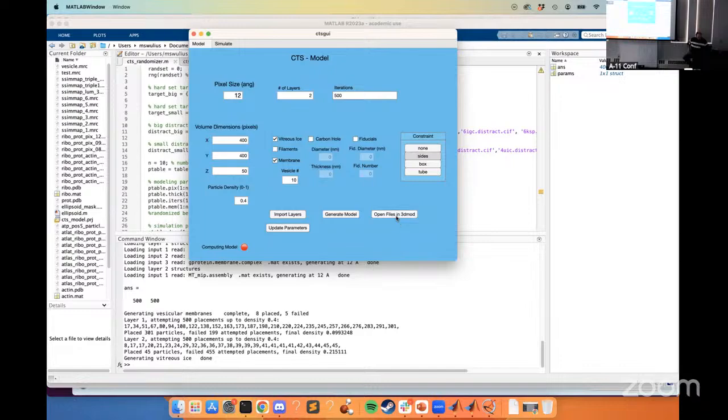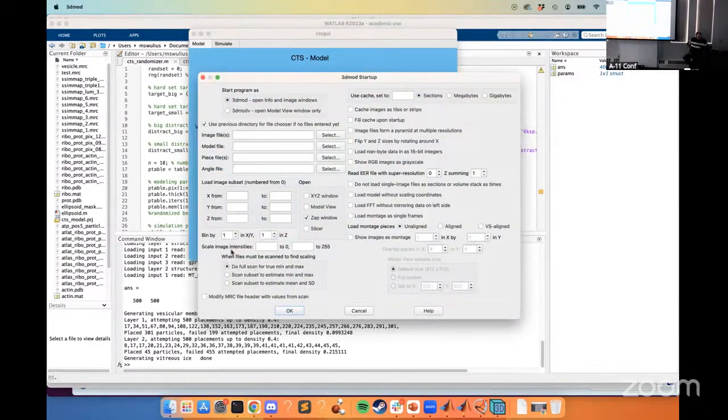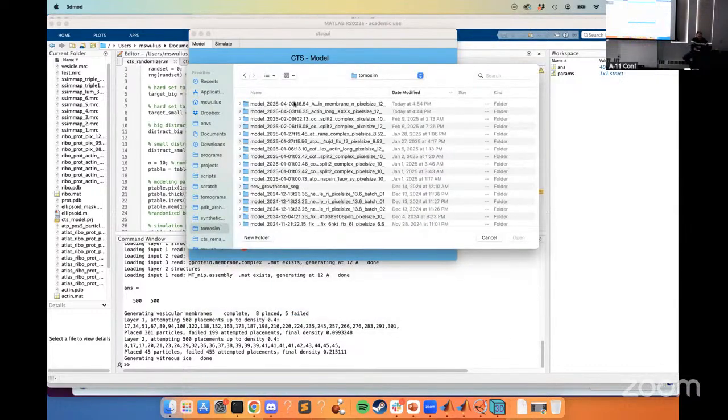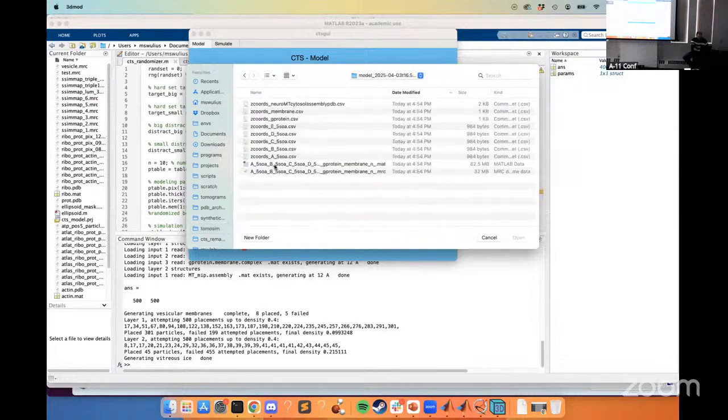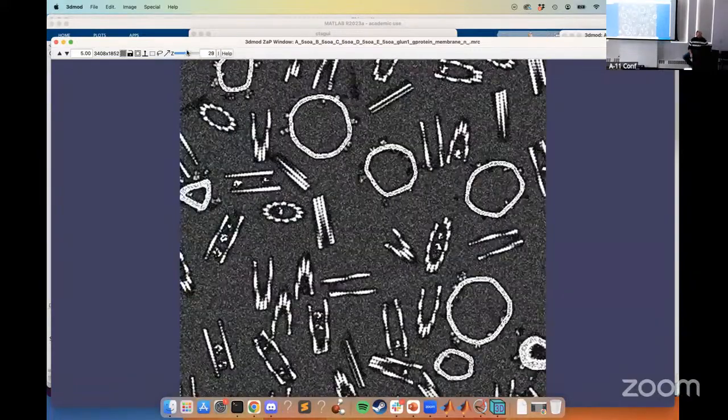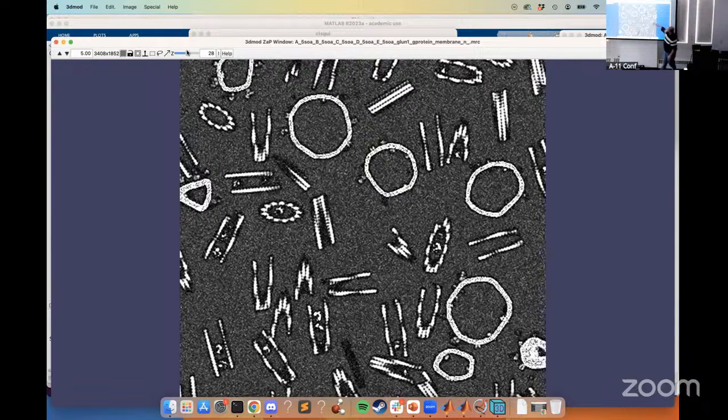Simulate. I was just going to try to show you. What is this? Okay, so this is the model that it generated, right? It's got a bunch of microtubule pieces in it, but you can see the actual membrane, where there's a G-coupled protein receptor here on the inside. You can determine which side it flips in and out of.